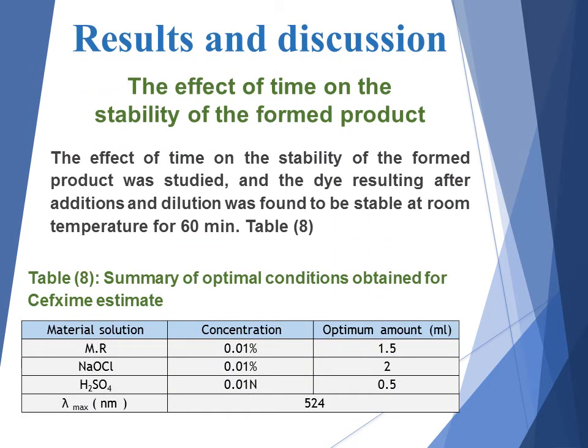The effect of time on the stability of the formed product. The effect of time on the stability of the formed product was studied, and the dye resulting after additions and dilution was found to be stable at room temperature for 60 minutes as shown in table 8. Table 8, summary of optimal conditions obtained for cefixime estimation.